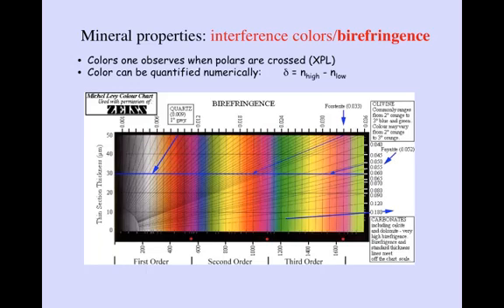That's the word I was looking for, anisotropic. You'll also see that it shows first order interference colors from 0 to 550, a second order set of interference colors from 550 to 1100, a third order, and on. That corresponds to a repeating set of interference colors above.